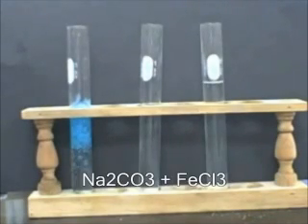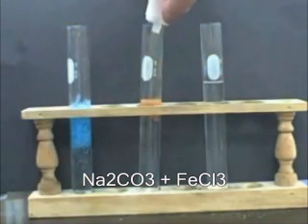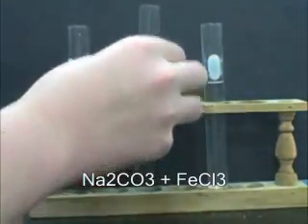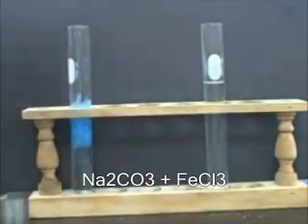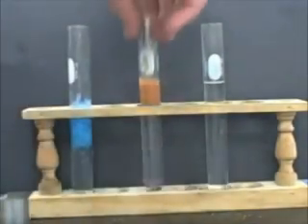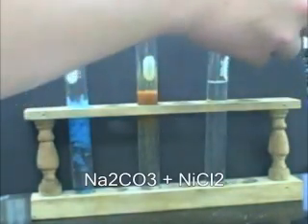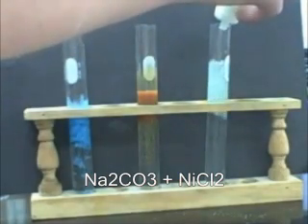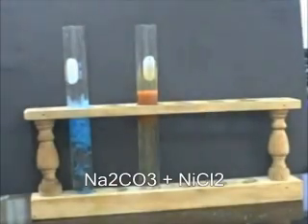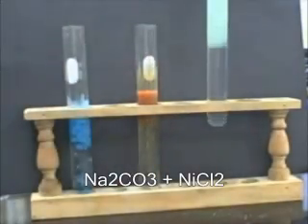To our second solution of sodium carbonate we add iron chloride, and the result is iron carbonate, the precipitate there. So we have iron carbonate forming when we mix the iron chloride with the sodium carbonate. To our third vial of sodium carbonate we add nickel chloride. The result is nickel carbonate. Again, insoluble, and the colors of these precipitates look very similar to those of the hydroxide precipitates. So we have 3 precipitates formed with the carbonate ion.